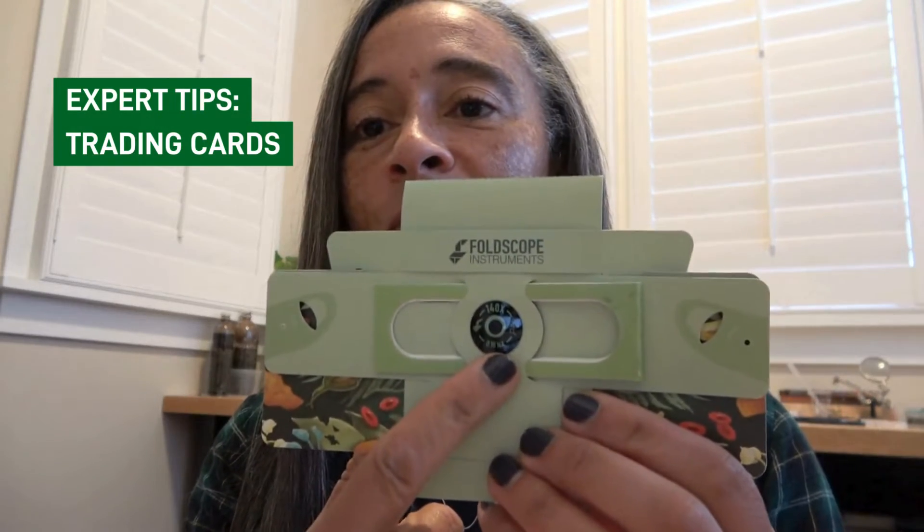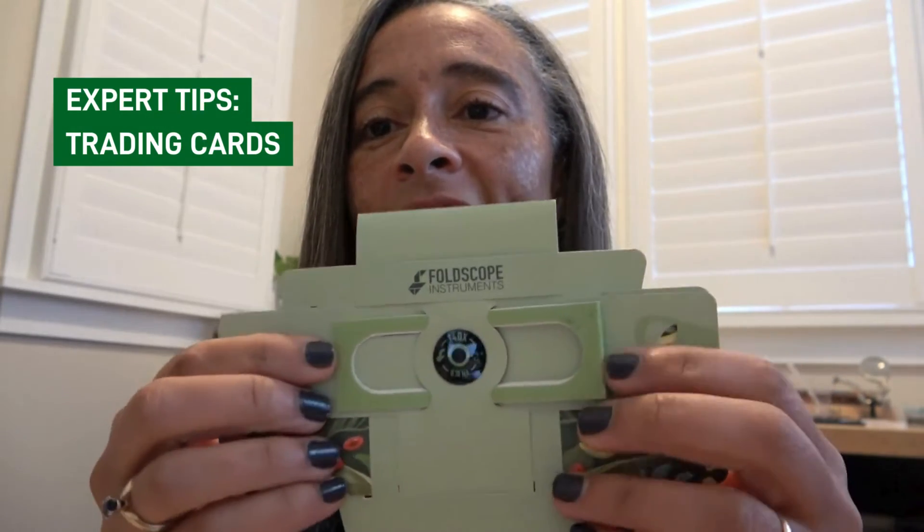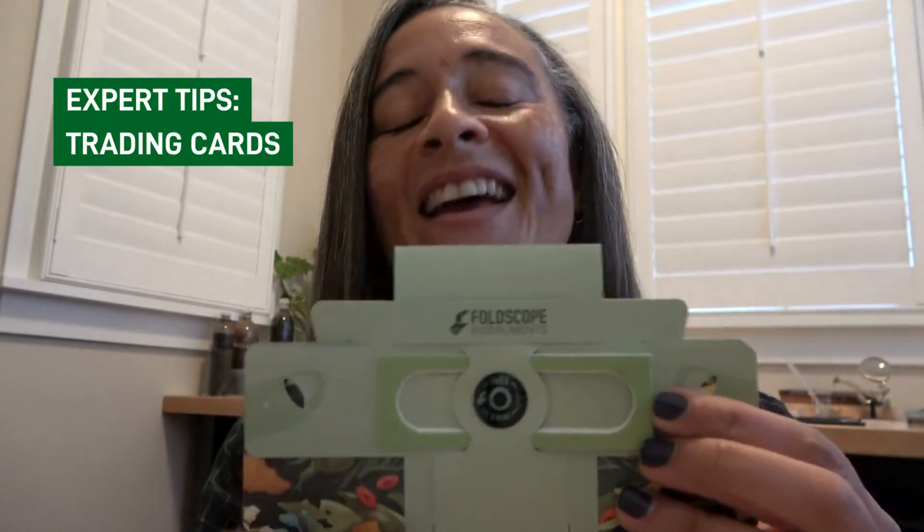Then you're going to view through the lens, adjust your focus using the focus ramp, and enjoy discovering the Microcosmos.